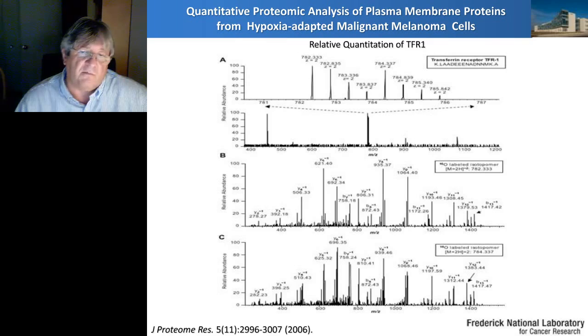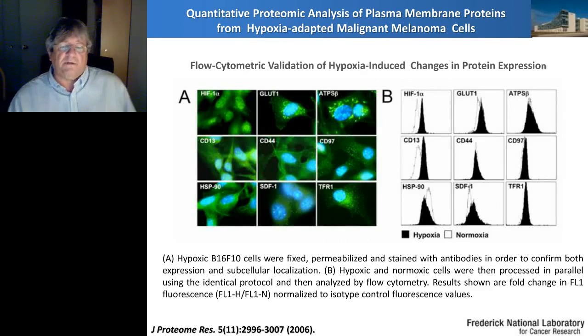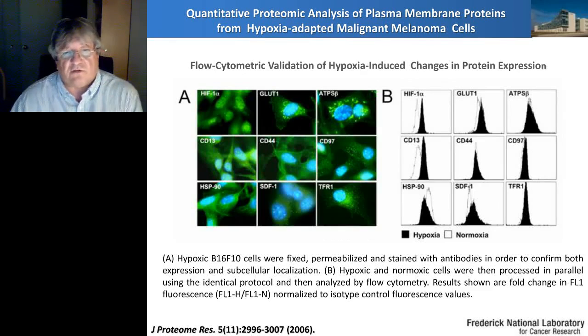It was the biomarker that we were looking at as a marker of the purity of the plasma membrane prep, and obviously there are no significant changes, and we do not expect them, but this is just educational to show that we can see heavy and light label peptides in the control and experimental cell line.